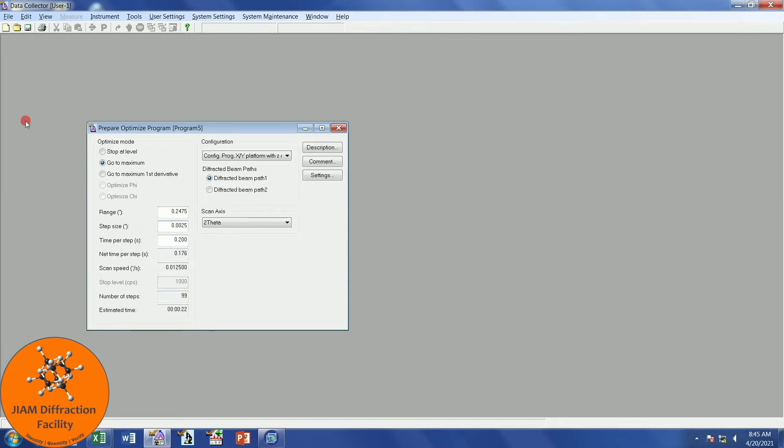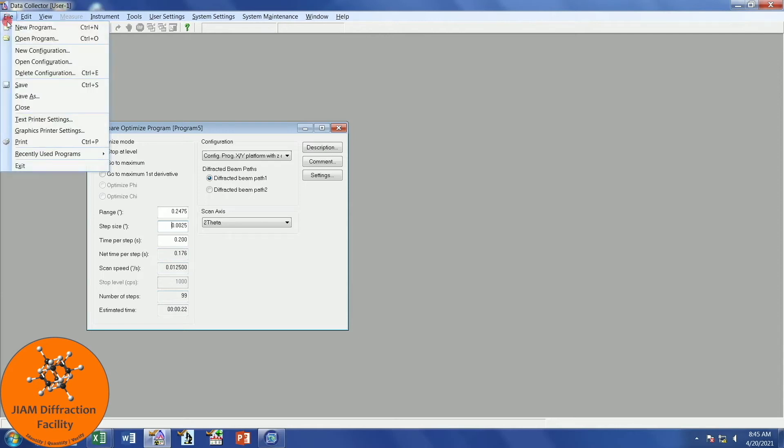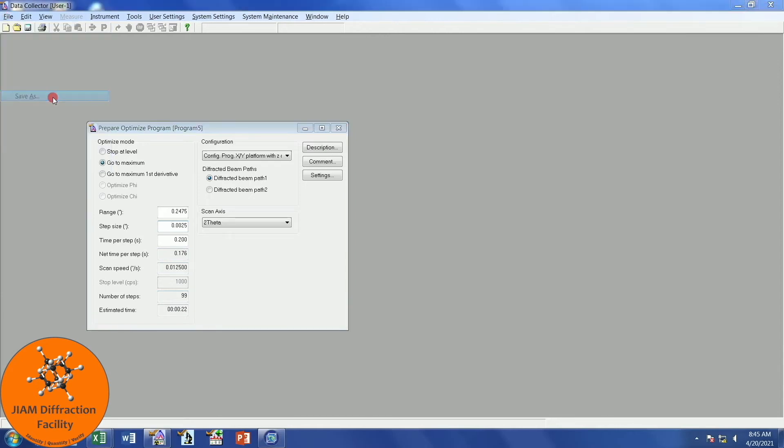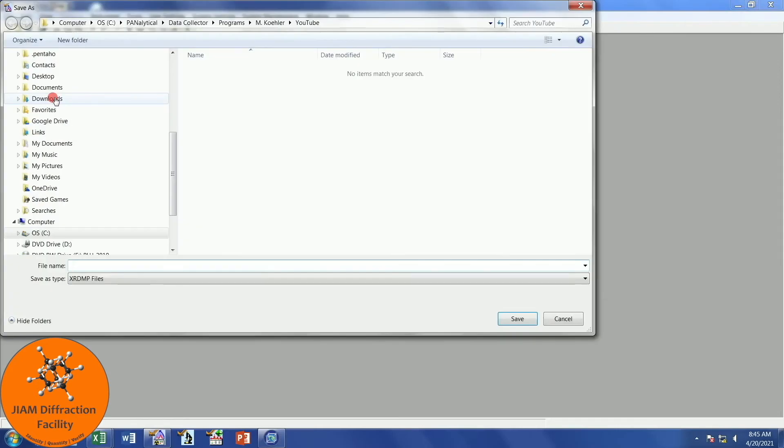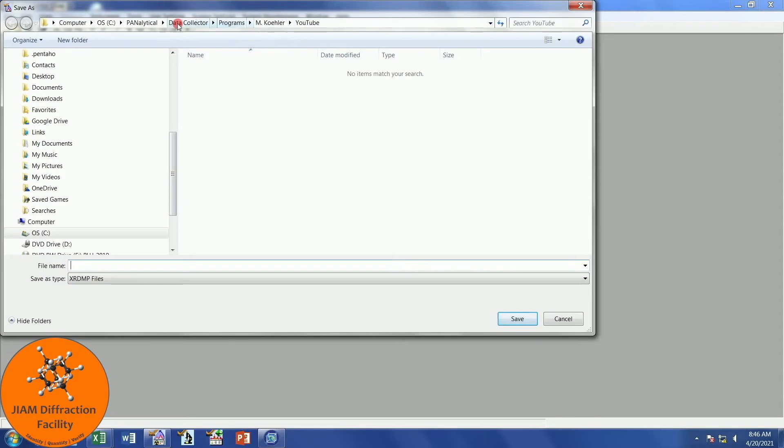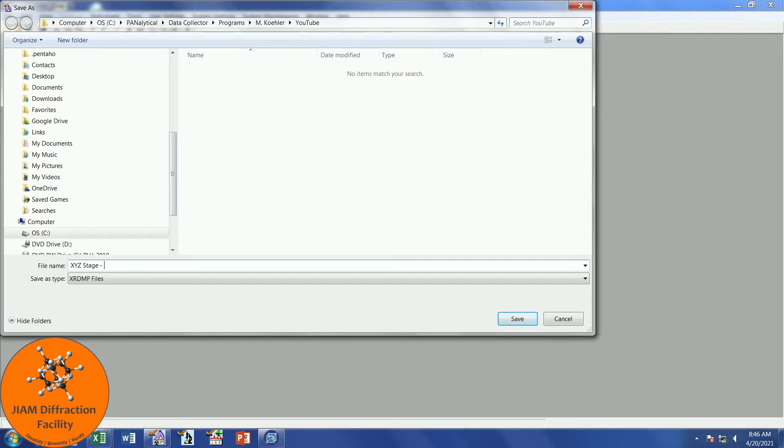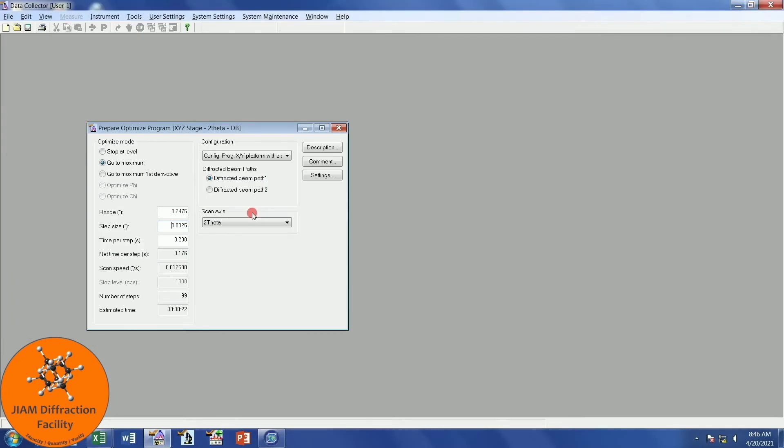Let's go up here and File, Save As. I have this set up automatically to go to my YouTube folder, but if you need to click around and find where you want to save this, go ahead and do that. I'm going to call this XYZ Stage so that I know what configuration this program will work with. It is a 2 theta scan, and we are performing a direct beam alignment. I will hit Enter on the keyboard.